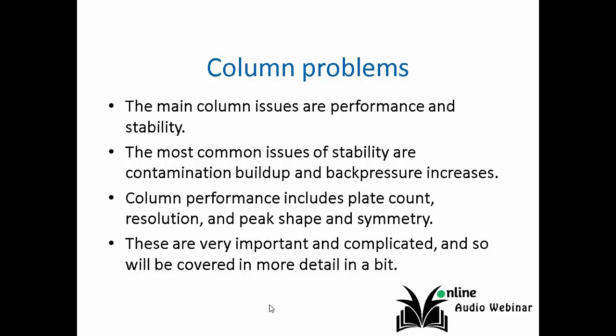Once you've decided on a column, which in itself is one of the issues in method validation that gets overlooked, because an auditor may ask you why you chose a particular column, because increasing tailing implies that something is going on, more than likely with your column. Flush off the column with a strong solvent mixture, a strong mobile phase, at some point to get everything off, and then you re-equilibrate it.